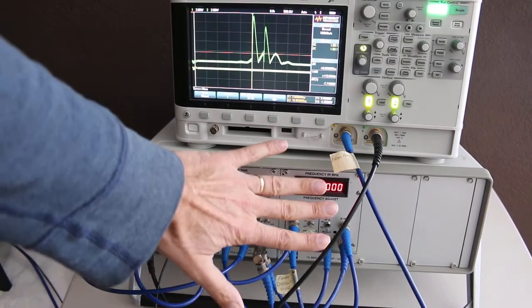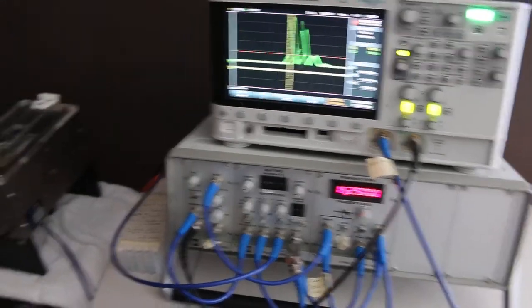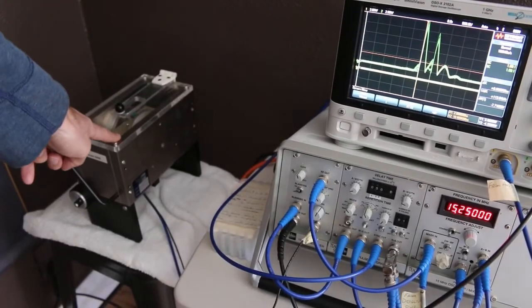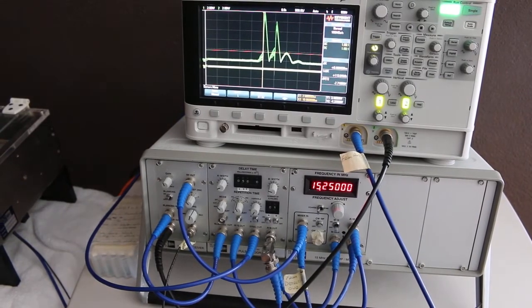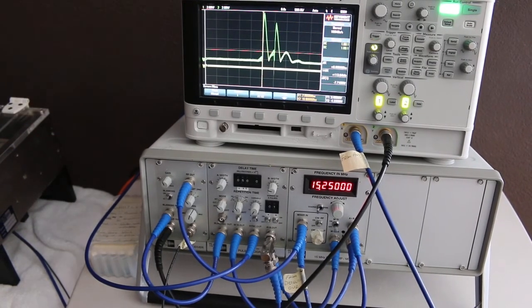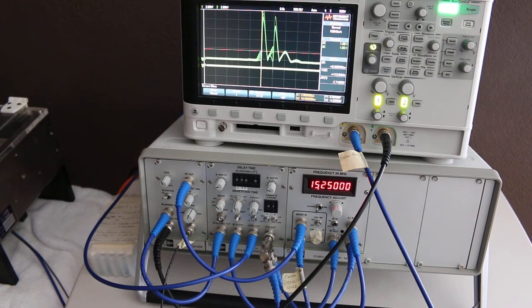And essentially, the control panel here is going to both apply and look at receive signals from the sample holder over here, and you look at the results you get, both being sent out and coming back on the oscilloscope. And as I mentioned, that's where your raw data will come from.